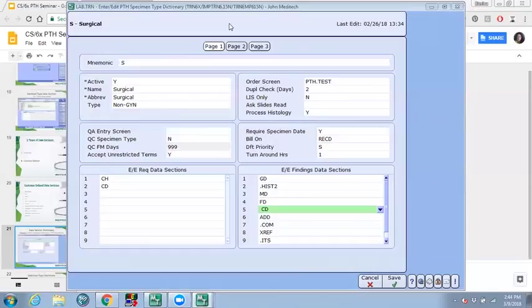Presently, our system forces us to manually match this up. It could be handy to use an alert of a second specimen by Meditech. Can the duplicate check cross the cytology and the surgical divide? So Alicia has provided an answer as well, saying that you could duplicate check if these are within the same department and use the department level duplicate checking.